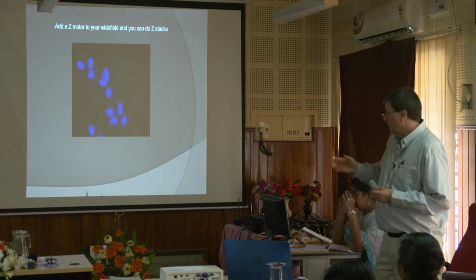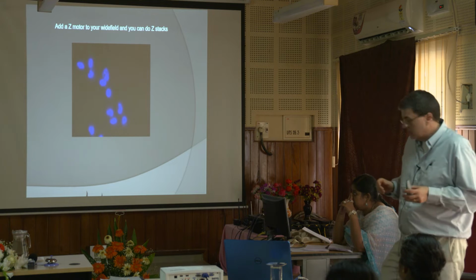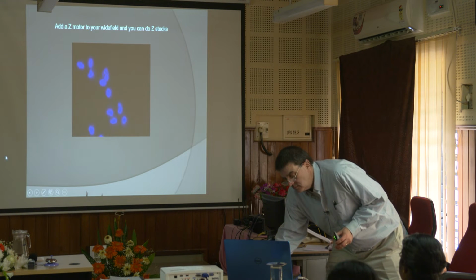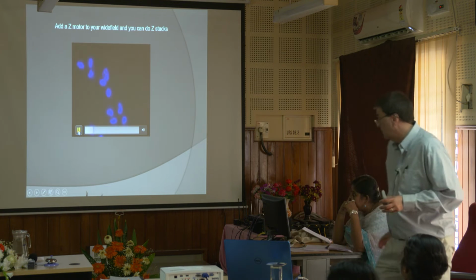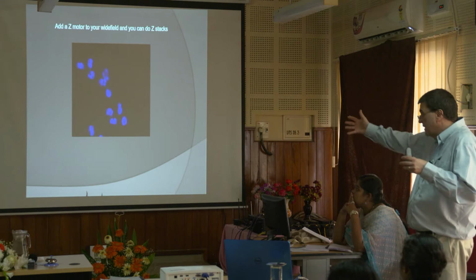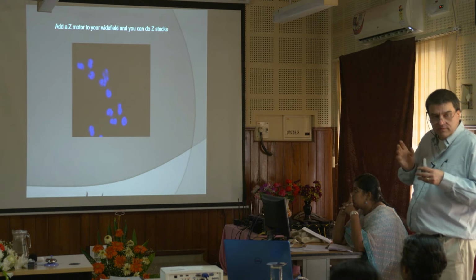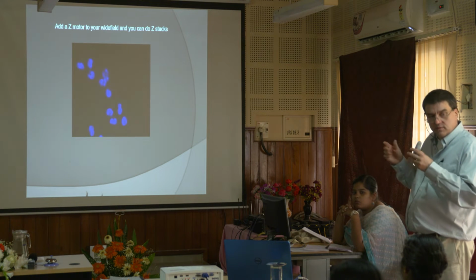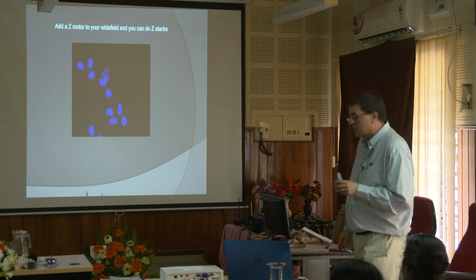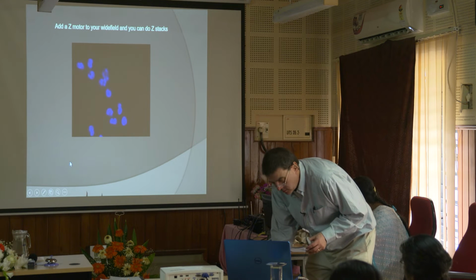Okay, so this will now be playing through this in Z. This is actually nuclei from cells, stained with DAPI, the blue dye. See how it goes through them. It changes focal planes. Now, you usually would think of this as confocal, but I was able to do this on a wide field, okay? And I'll teach you a little bit about that when we start talking about deconvolution. So you can use a wide field as a confocal to some extent if you know what you're doing. We call it poor man's confocal.